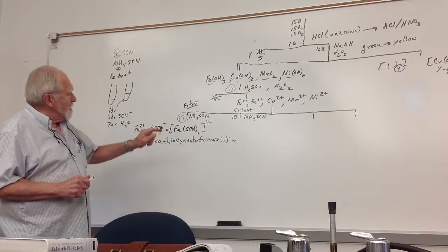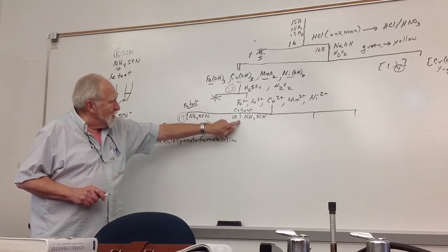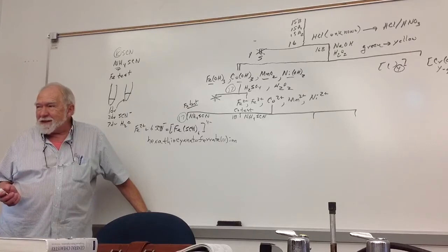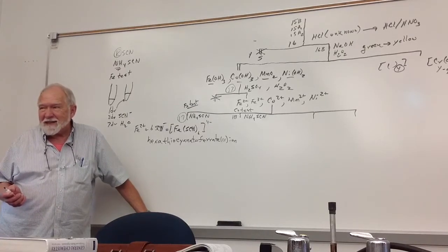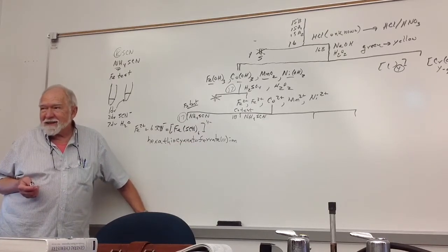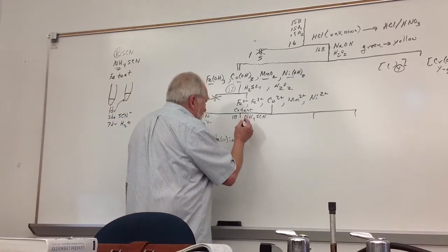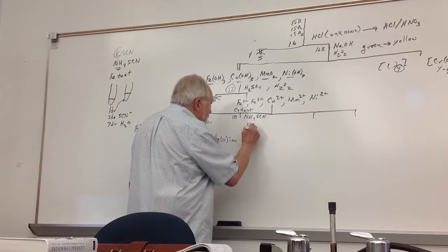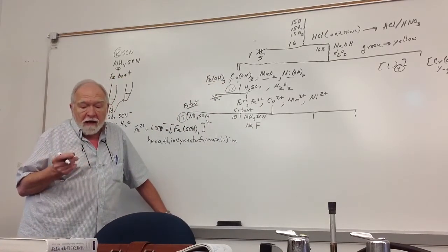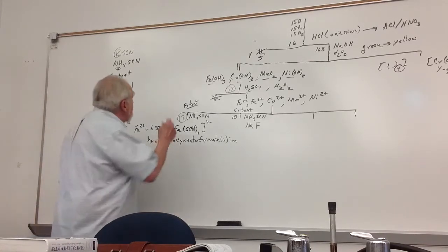Okay, so coming back to this one, here I did ammonium thiocyanate and I got this complex. In the other quarter of the solution, I did ammonium thiocyanate and I'm doing a cobalt test. What would you say should happen there? As soon as I add ammonium thiocyanate, you should get the dark red-brown precipitate. Why don't you? Well, before you do that, and actually, if you forget, you can do it afterwards. You're going to add sodium fluoride. Now the sodium fluoride is a white solid. You want to add a little bit on the tip of the spatula, you want to make a saturated solution of sodium fluoride.